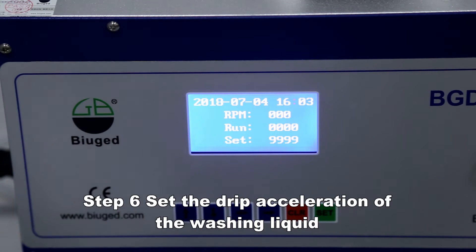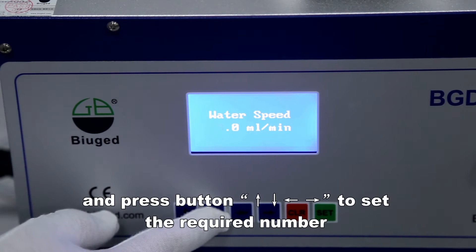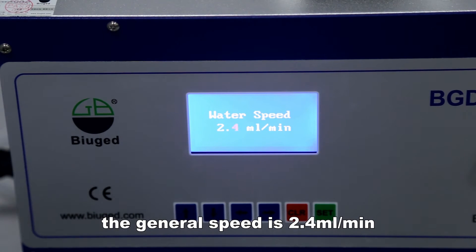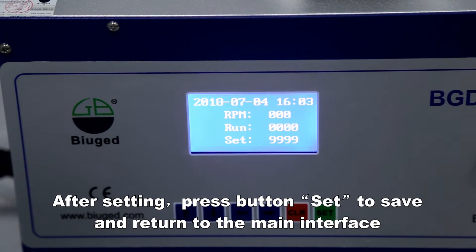Set the drip acceleration of the washing liquid by long pressing the button and pressing the button to set the required number. The general speed is 2.4 milliliters per minute. After setting, press the button to save and return to the main interface.